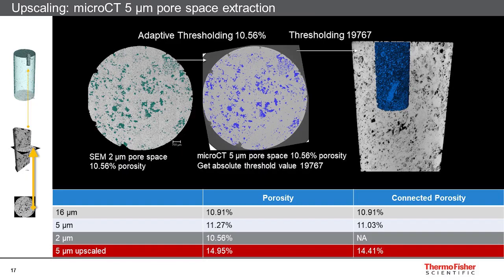With this method, we assume that the missing porosity is lying in the lowest intensity regions. This is quite logical since microporous regions globally have a lower intensity than rocky ones. As we had obtained 14.41% for the connected porosity, the porosity result is encouraging.